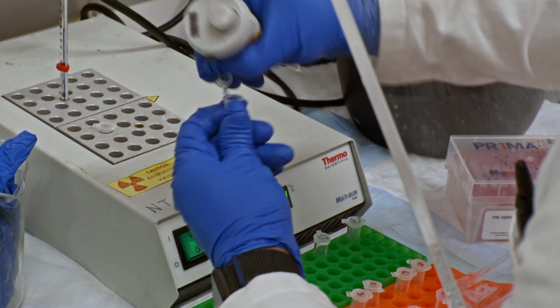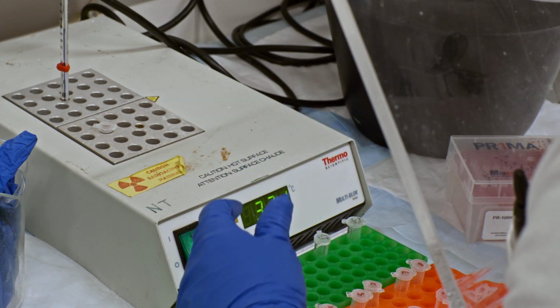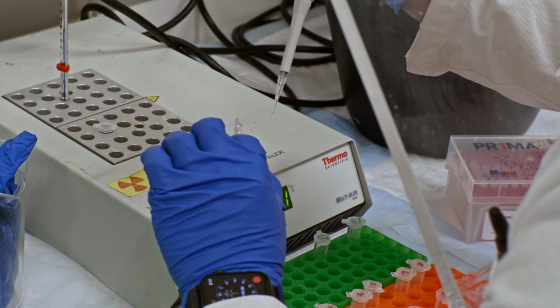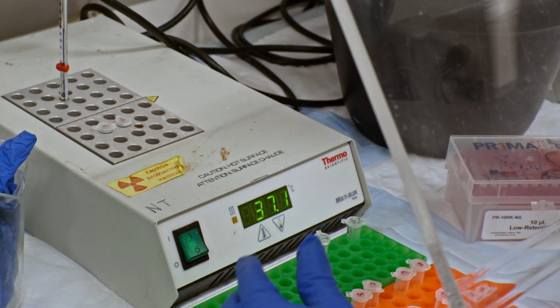So another pipette tip ready to go. I'm currently at 42 seconds. I'm going to collect a fresh portion of dNTPs. Here's my aliquot. Cap it. Return it. I'm at 53 seconds.